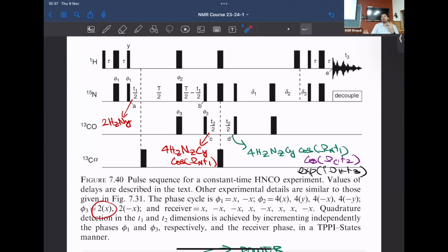That is going to cost overall loss of coherence or magnetization, which is going to reduce your overall sensitivity. So as you increase more and more dimensions, it comes at a very good advantage of resolution, but at the cost of total measurement time and sensitivity. So unless there is a need, people will not keep adding more and more modules. So 3D is a very good optimum such that you get good resolution and reasonable sensitivity.